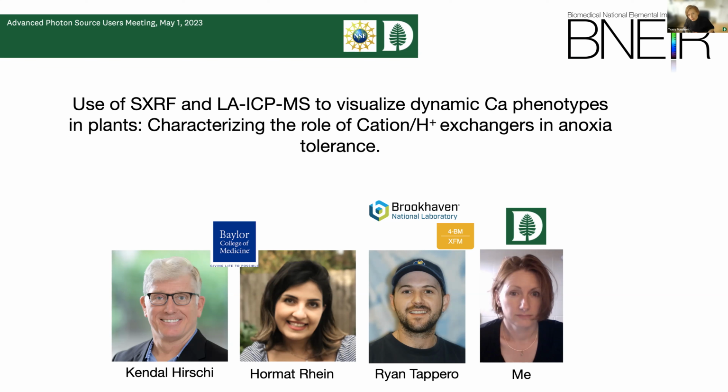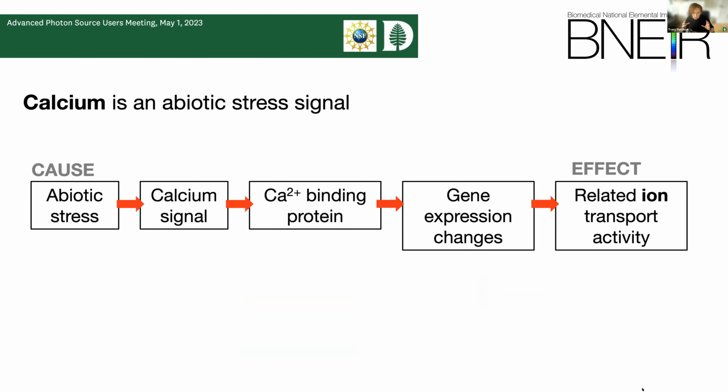And as Olga said, I use several elemental imaging techniques, laser ablation, and now most recently laser ablation ICP-TOF, to image various biological and biomedical specimens. So I want to jump right in and talk about calcium and why we're interested in calcium. We are interested in calcium as an abiotic stress signal.